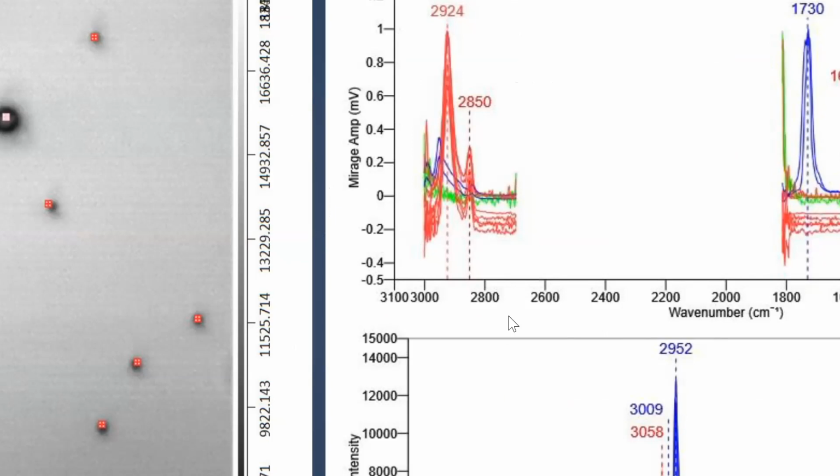And the green are actually atmospheric particles that aren't microplastics. Then down here on the bottom, this is the Raman spectrum for those same particles, as we have IR spectra up top. These are really sharp, nice looking spectra. We're working both with our statistical colleagues, as well as using things like the Wiley KnowItAll software, to try to match these now and get a good understanding.